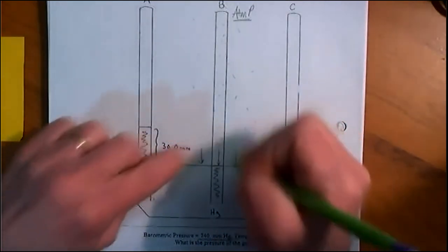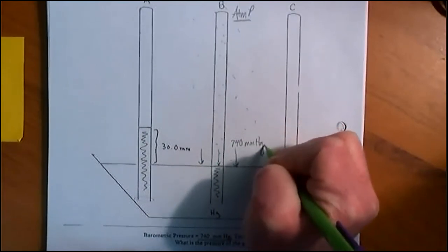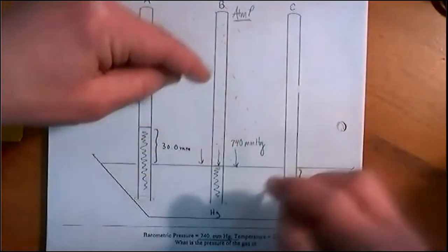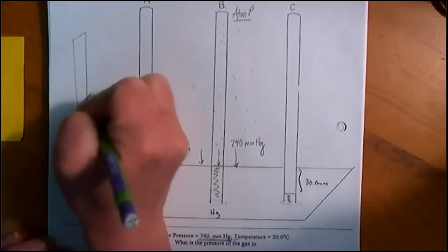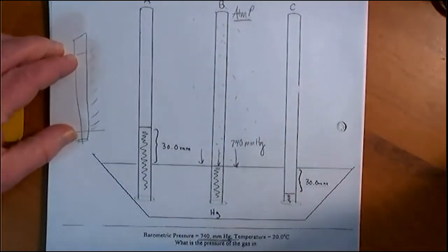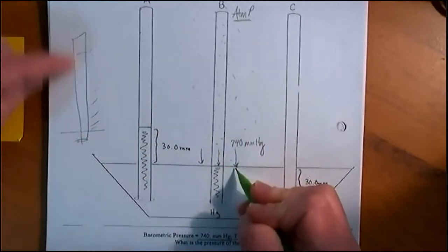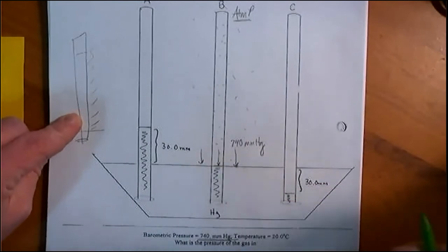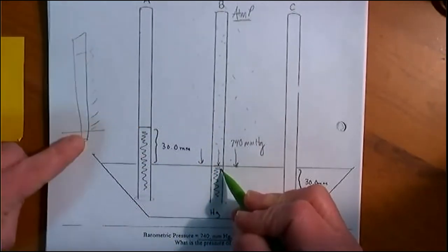And if the levels are equal on the inside and out, doesn't that mean the force is equal? And so if the outside pressure is 740 millimeters of mercury, meaning the forcefulness can support a barometer that we would measure to be 740 millimeters of mercury, well then, can't we make the comparison that if that's what the atmosphere is reading in a barometer, if the liquid levels are the same inside and out, it's mercury here, it's mercury here, it's mercury here.